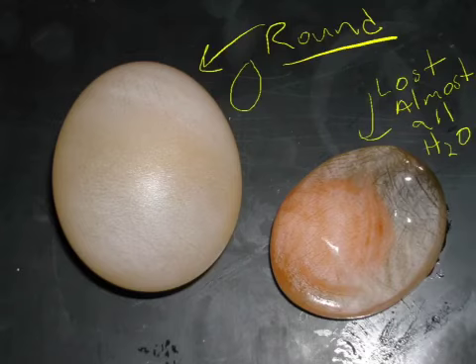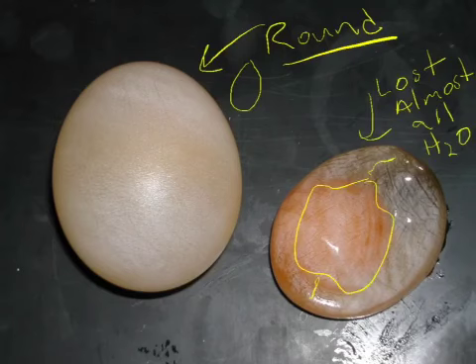The only thing you can see is the internal anatomy, the egg yolk, the chalaza or whatever. You can see it here, a little wiggly line over here, a little wiggly line over here in the yolk outline here. But all the water's gone. It's intense when this lab actually works out well.